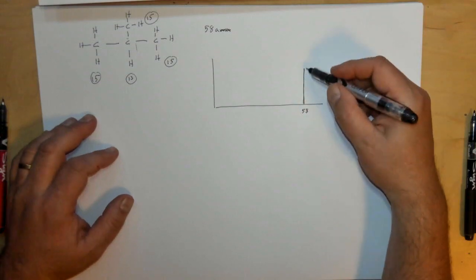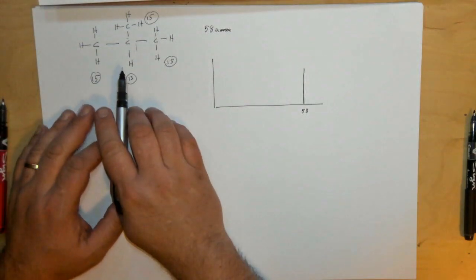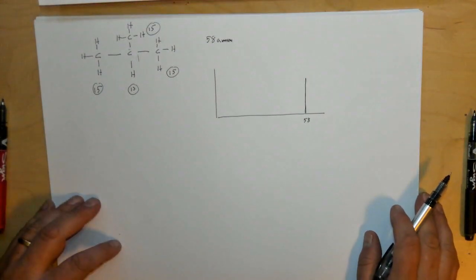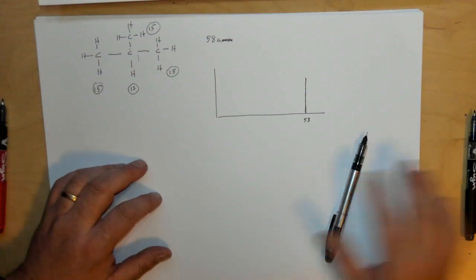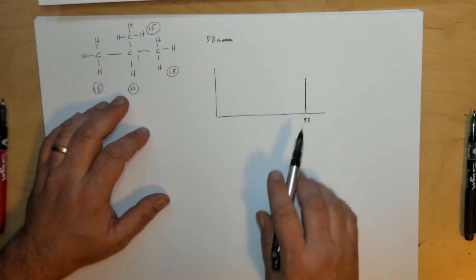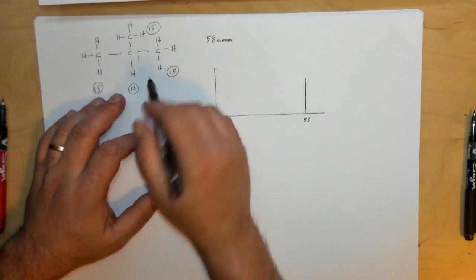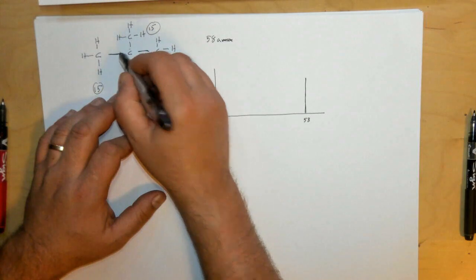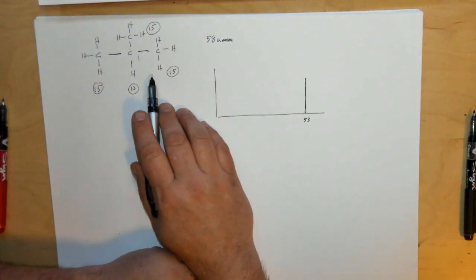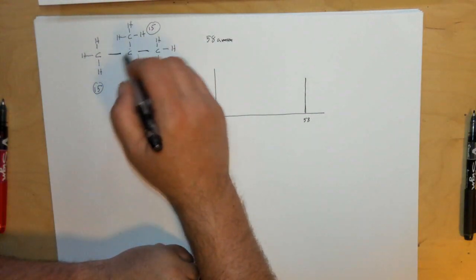The size of this peak will depend upon how hard the ionization process was, or how strong the ionization process was when you did the actual test, the test of the sample. Because if you have a higher ionization energy, meaning that if you use more ionizing radiation, or an increased number of electrons that are bombarding this molecule, then these bonds will break.